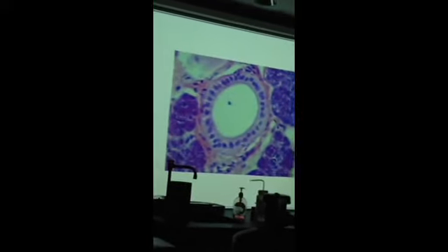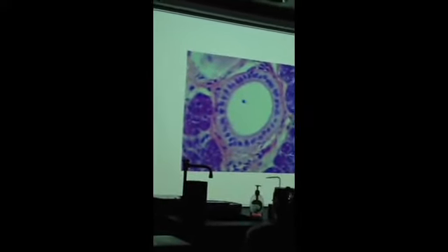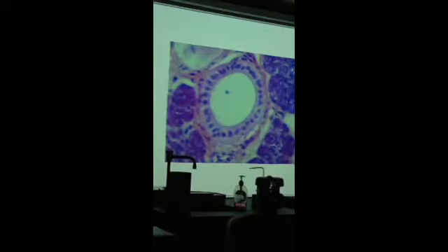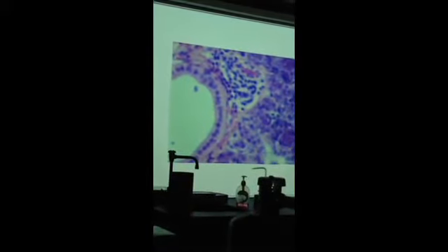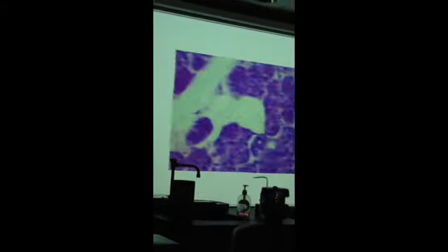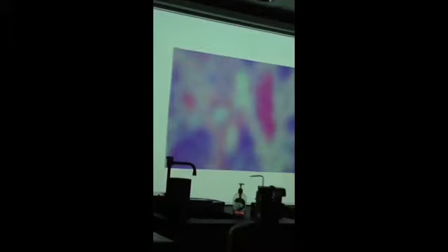And again, what type of cells are these, the dark stained ones? Serous cells. They produce the thin watery secretion high in enzyme. Again, the enzyme is amylase. There's another salivary gland duct. You can see the simple cuboidal epithelium indicated by that single layer of rounded nuclei. There's a couple of blood vessels. See the blood cells in the blood vessel.